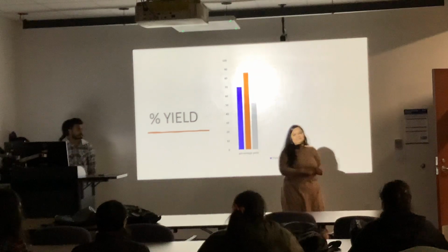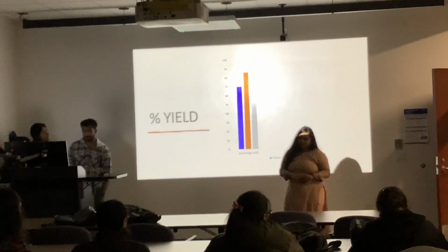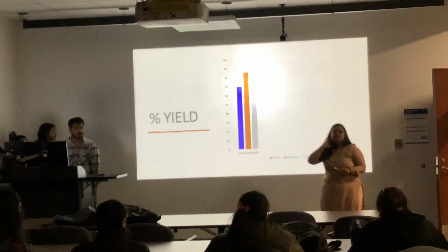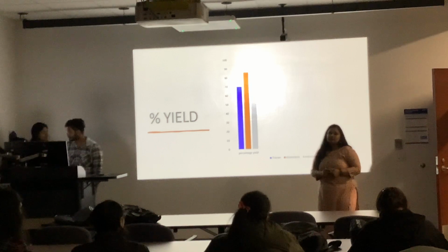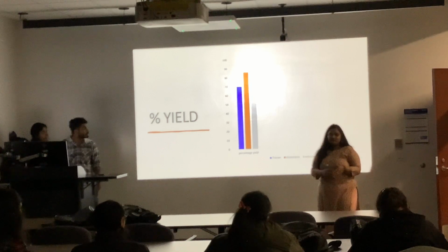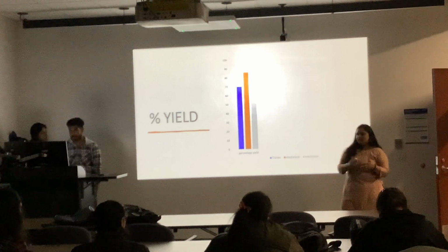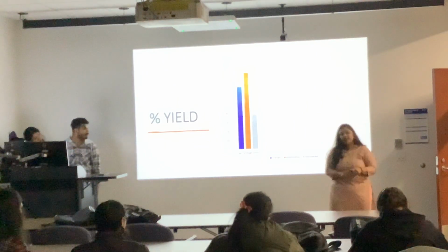Hi, my name is Janvi, and I'm going to discuss the result and discussion part of our biodiesel project. Here we used FTIR and GC as characterization techniques, because these techniques show the functional groups that are present in biodiesel in a very good manner compared to other techniques we have read.